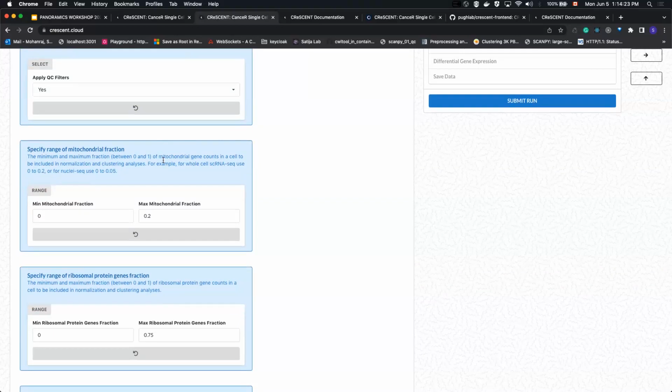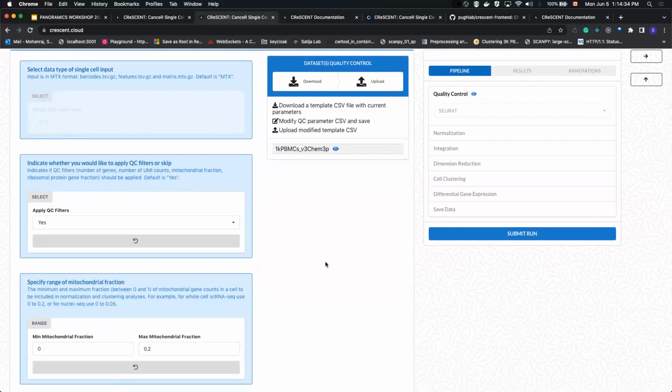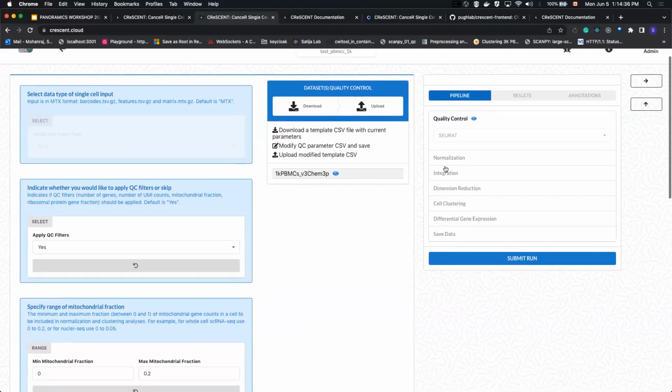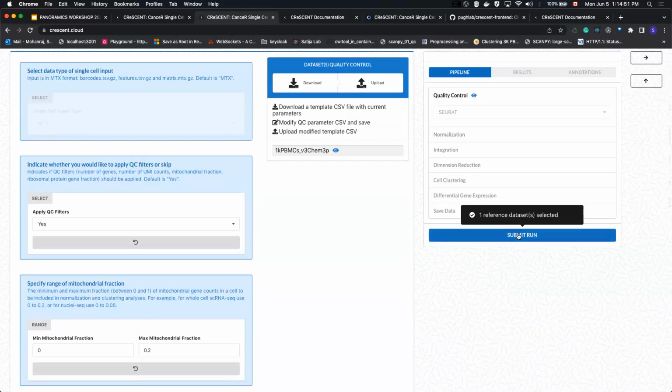So each one of these boxes is a different set of Seurat single cell RNA-seq analysis tools, except that when you're running this analysis in R, and if you did want to go and see exactly what we're running, I'll provide all the scripts and all the open source workflows. But we've made it simple for everyone to just go in and hit submit if you really wanted to.